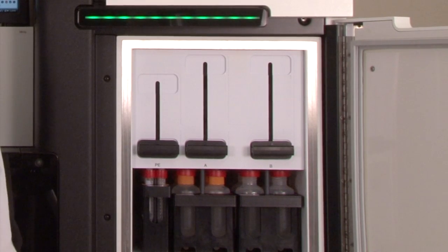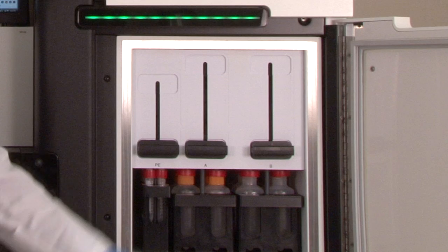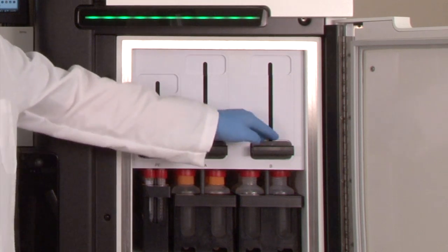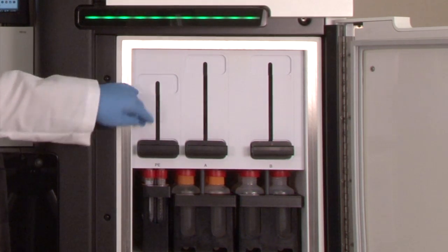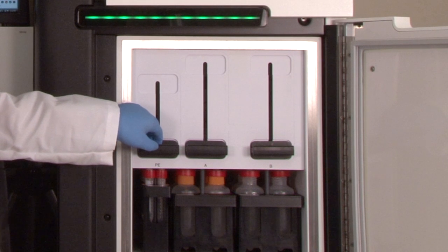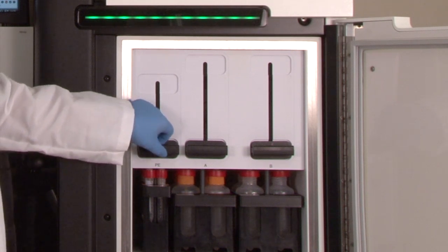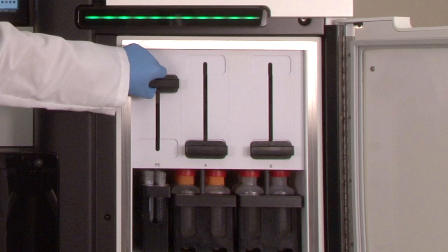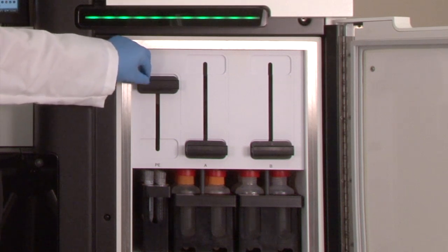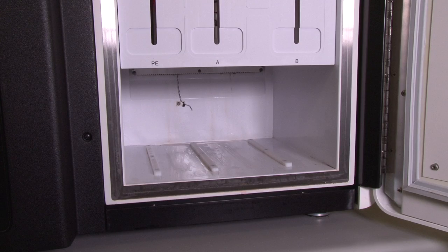The chiller compartment has room for racks of reagents for flow cell A, flow cell B, and a single rack for paired-end reagents for both flow cell positions. Each position has a handle that lowers sippers into the reagent bottles held in the rack.